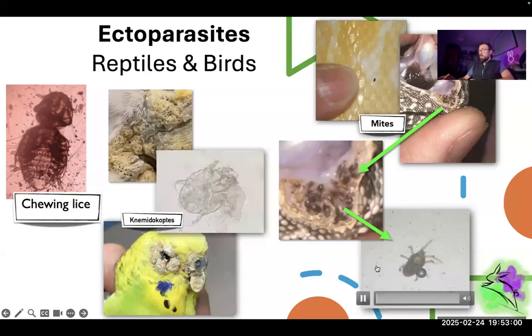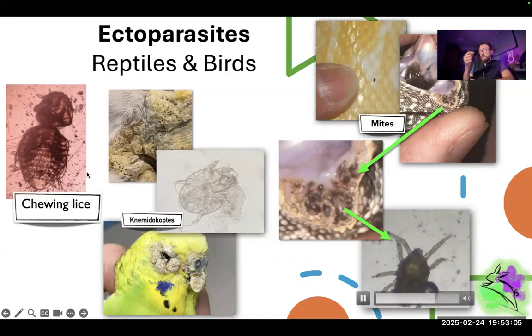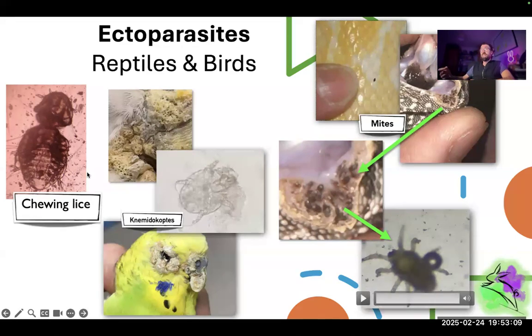And as you can see, what I did here was take a small sample, just to check what I was looking at, because they were very, very tiny. So I always like to double check under the microscope what I'm saying.